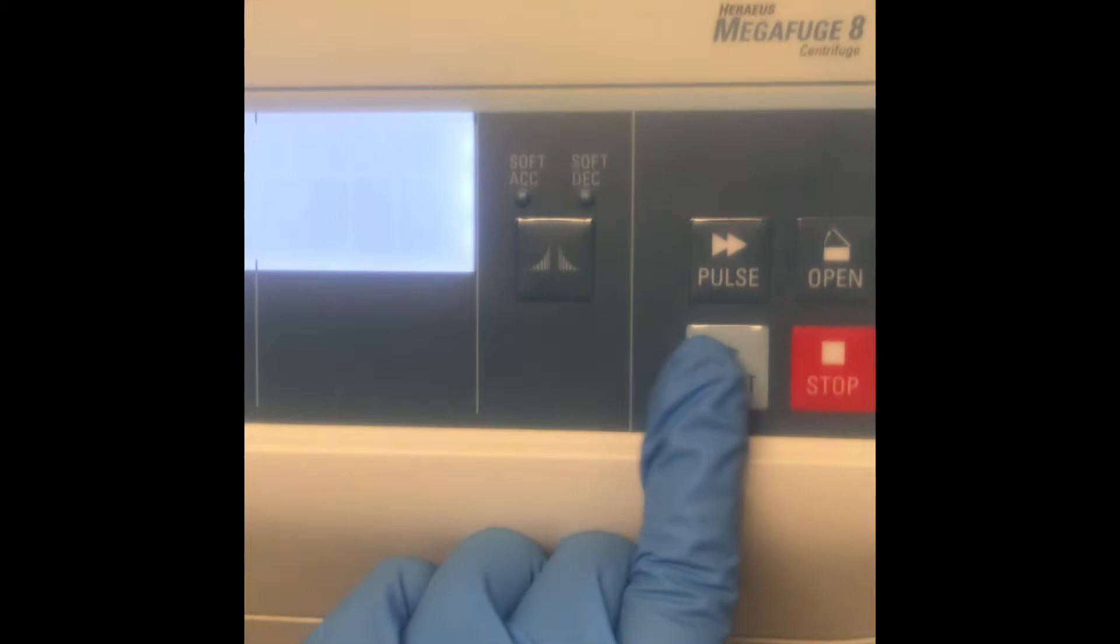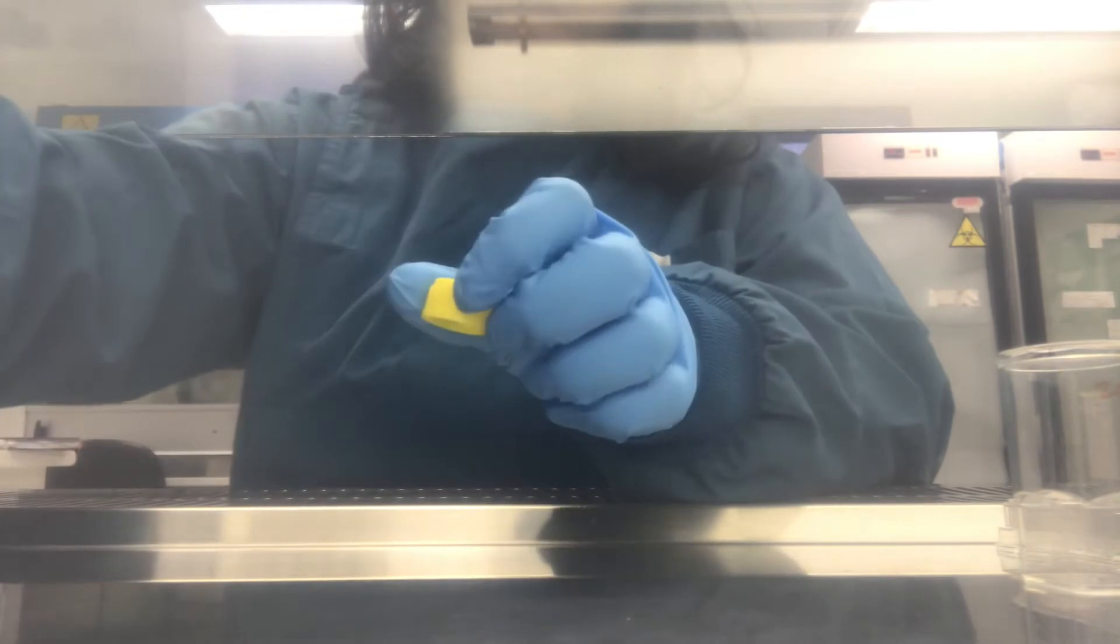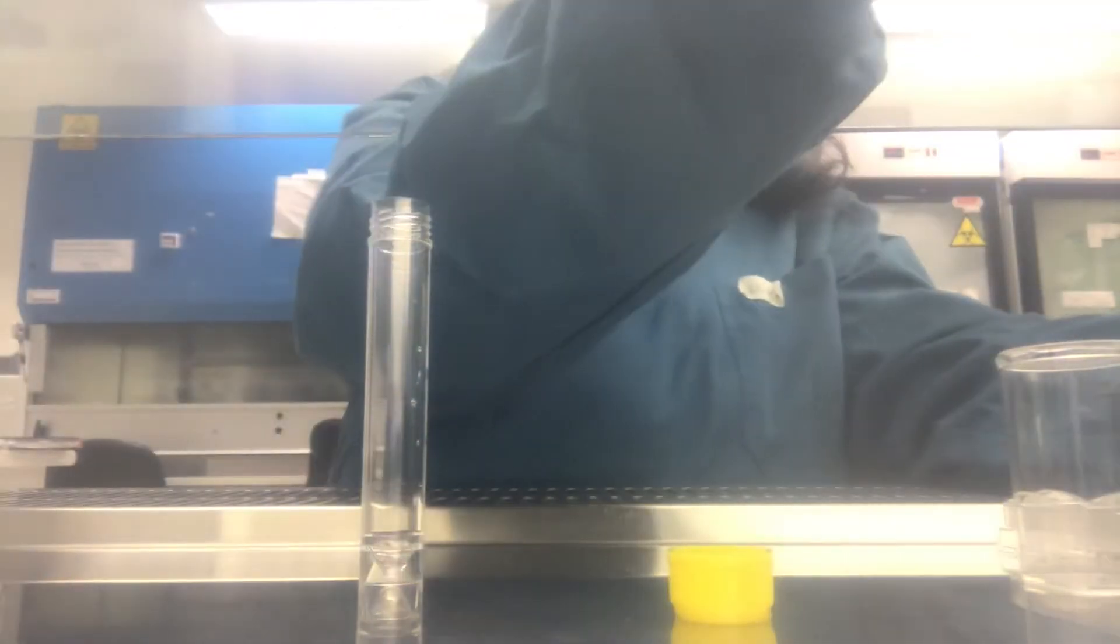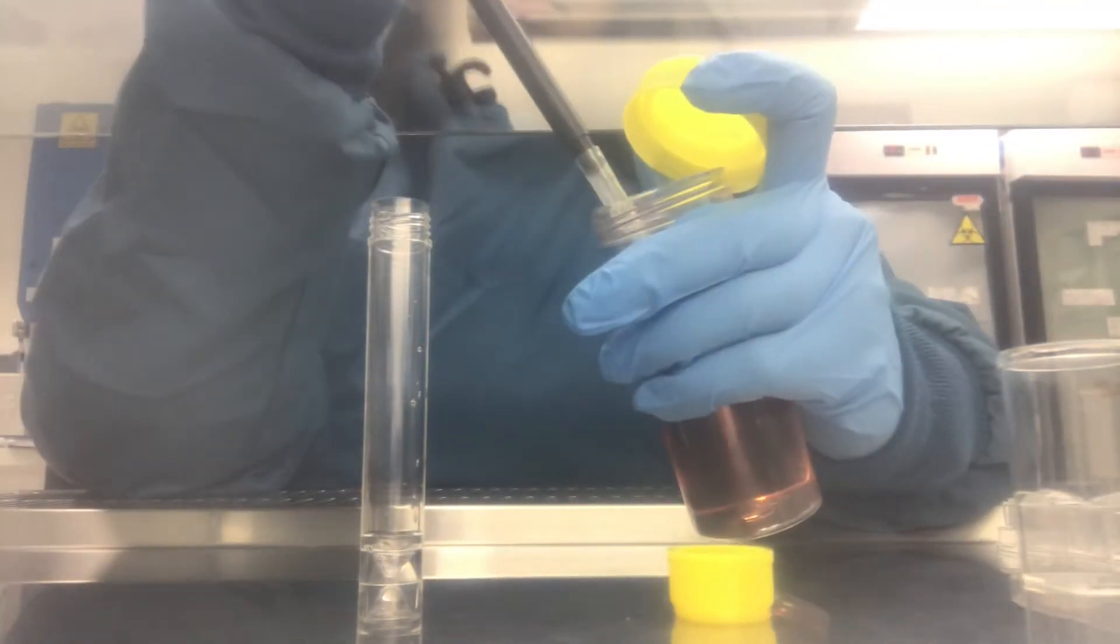Okay, once we got the pellet we have to discard the supernatant and then add fresh media. I'm just adding one ml, you can use according to the concentration that you need.